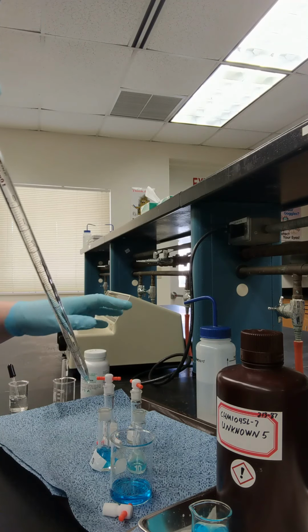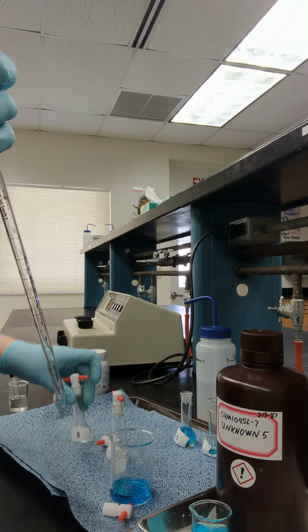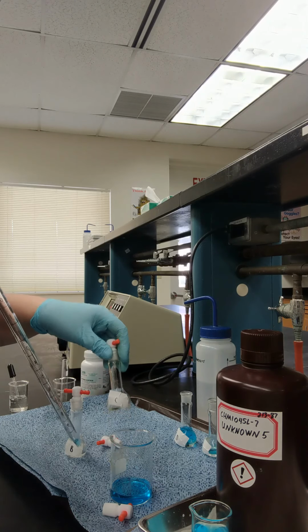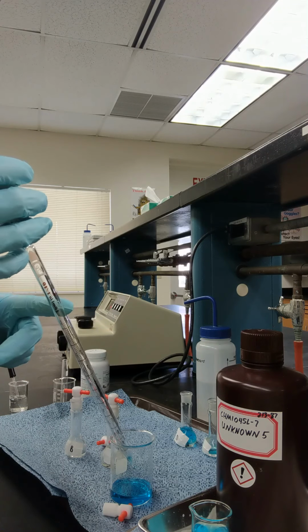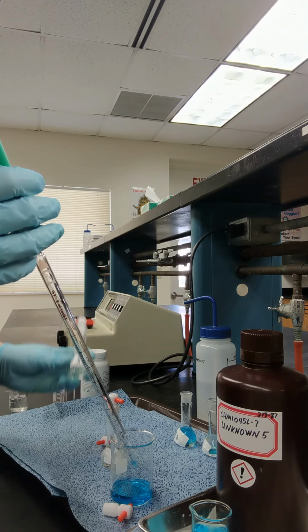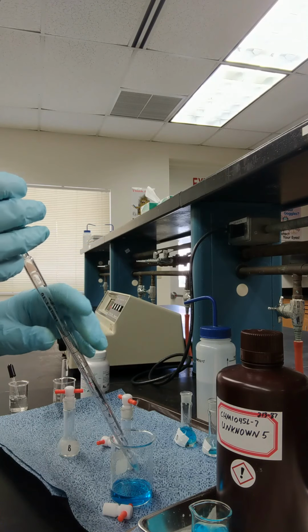And I'm going to do the same thing for standard C and standard B. For standard B, I need 4 milliliters, and for C, I need 6, so that's a total of 10 again. So I will refill my pipette all the way to 10. I will transfer the 4 that I need here, and then the 6 left will be transferred to volumetric flask labeled C.